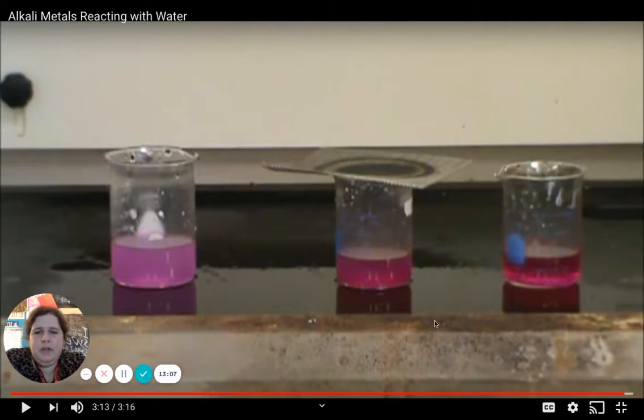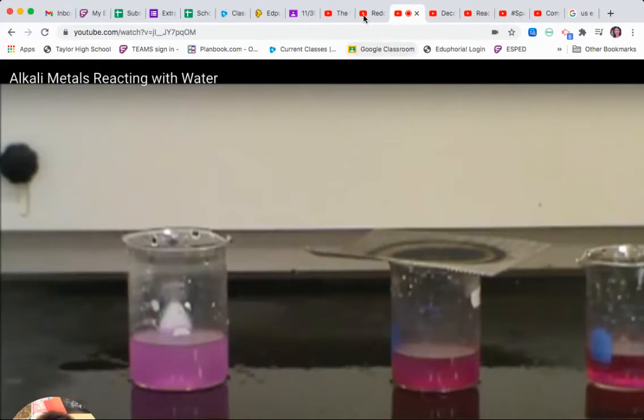So basically, we added elemental metals, sodium, lithium, and potassium, into just plain H2O water. And what we got out of it was hydrogen gas, an element, with a metal hydroxide. Sodium hydroxide if it was sodium, lithium hydroxide if it was lithium, potassium hydroxide if it was potassium. In all three cases, one element is replacing another. So I'll let you figure out what type of reaction that is.